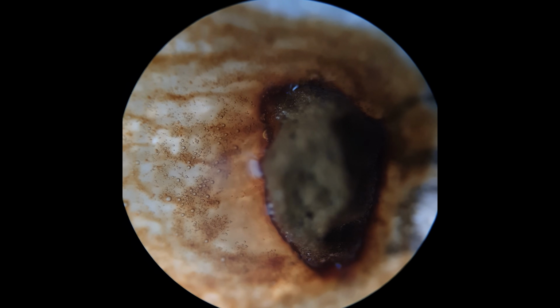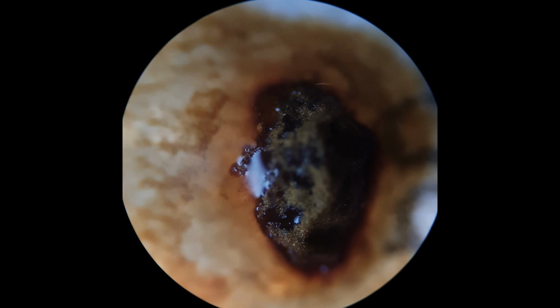And what we might have to do here is add a little bit more water to the edge of the slide, just to get things going a little bit. So we'll do that now. There we go. So you can see more of those bubbles of carbon dioxide forming. And you can see everything kind of being dragged as the water slides off the left-hand side of the microscope slide.